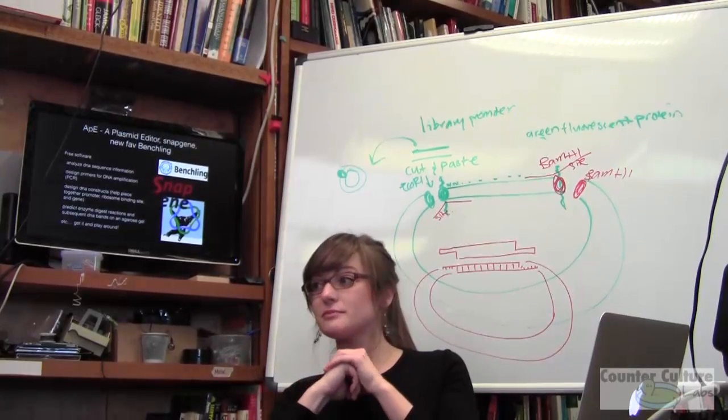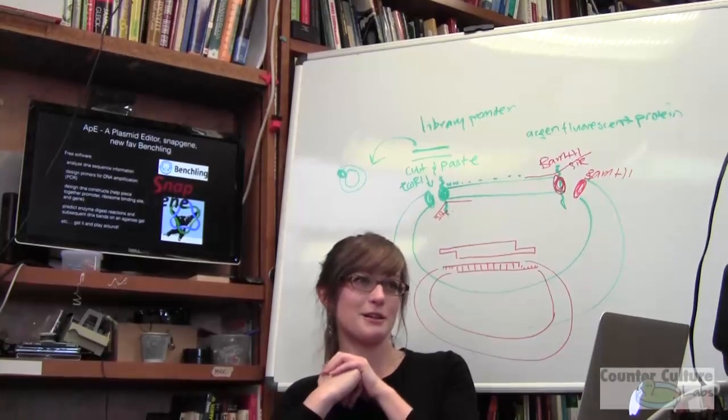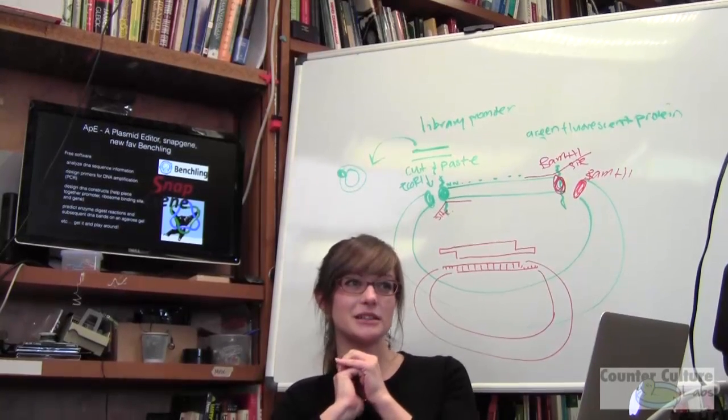The name is Benchling? Benchling, yeah. Like bench, L-I-N-G. As in henchling. This is kind of like SnapGene with a better version control and collaboration features. Exactly, yeah. It's pretty good.